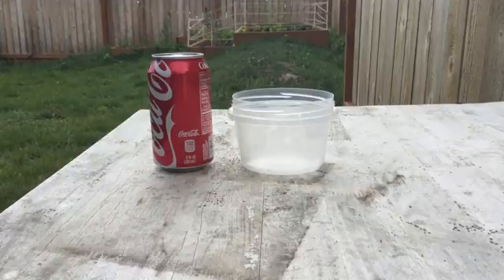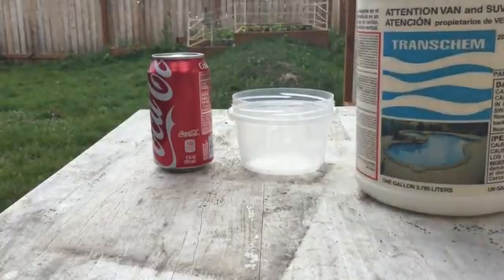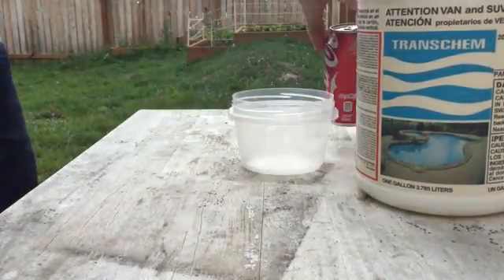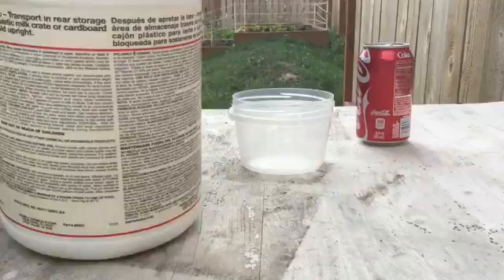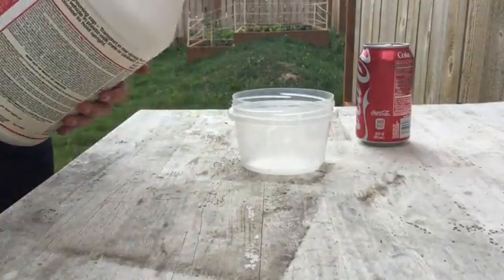Alright, here we go. Today we're going to be dissolving this can of soda in some acid. This is hydrochloric acid. Here we go, open this, pour some in.